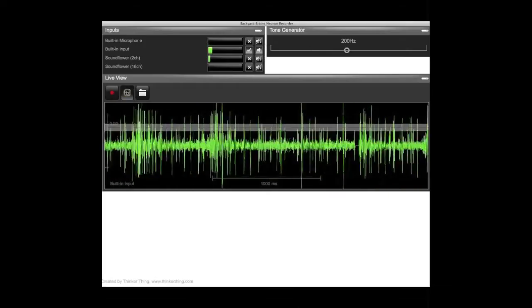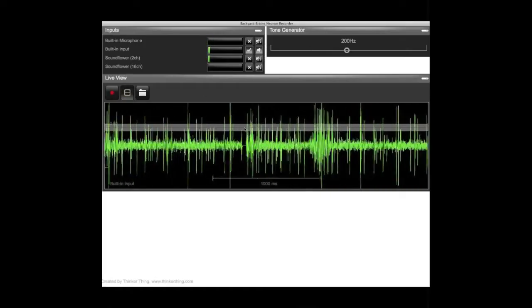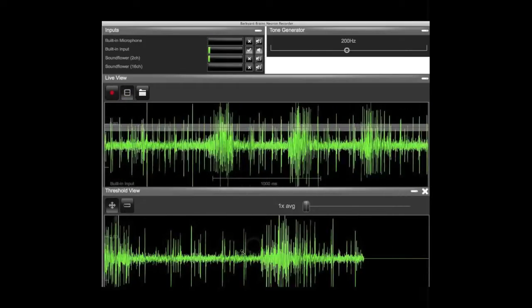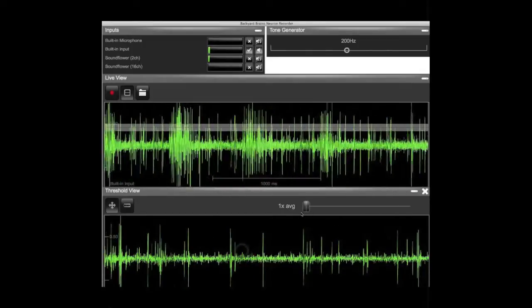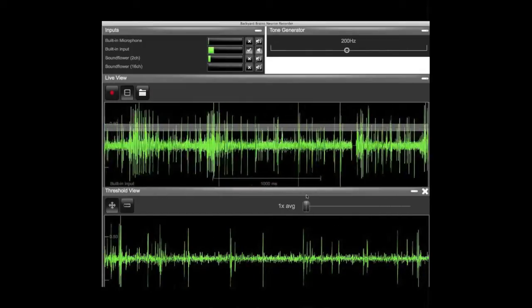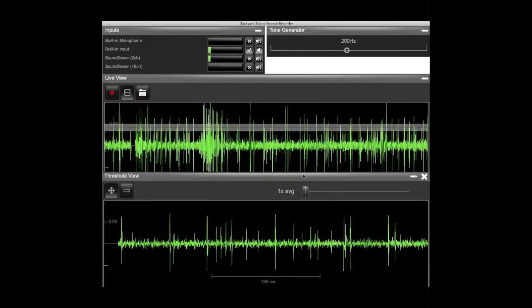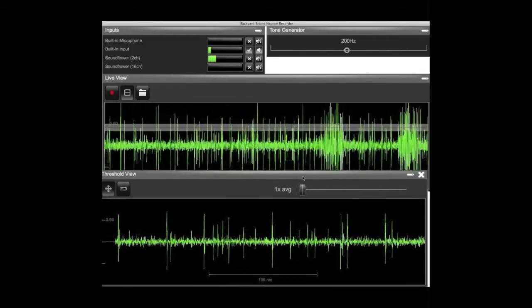You can also click the threshold icon in the live view to zoom in on snapshots of when the recording surpasses a selected threshold you choose.